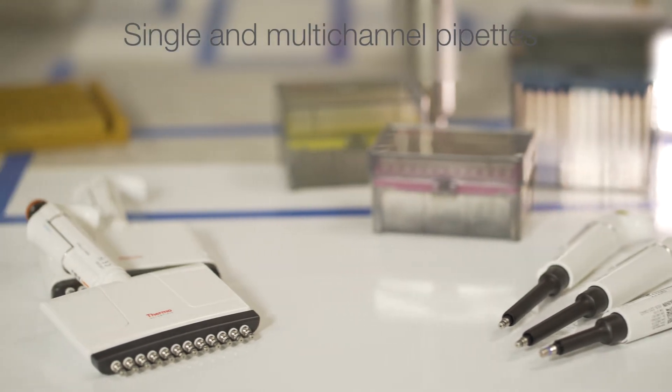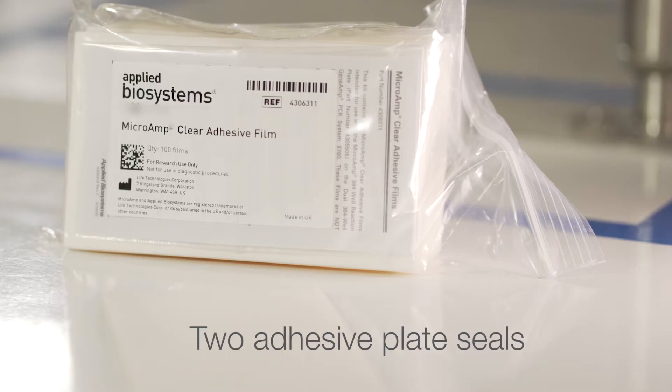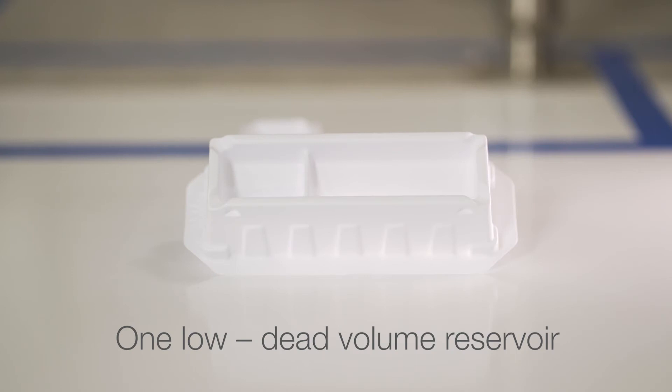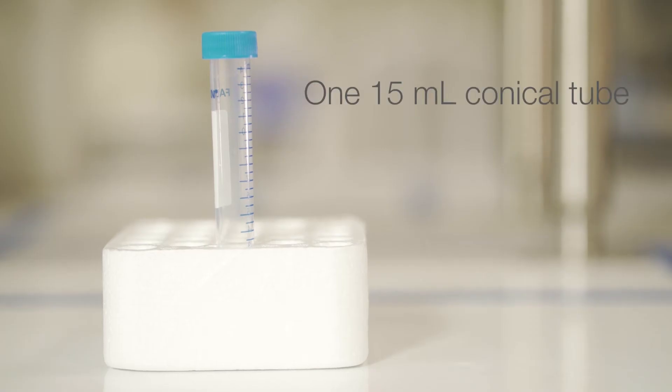Calibrated single and multi-channel pipettes, including ones capable of delivering two to five microliters. Two adhesive plate seals and one optical grade PCR seal. One low dead volume reservoir designed for small volumes. One 1.5 milliliter microcentrifuge tube and a 15 milliliter conical tube.